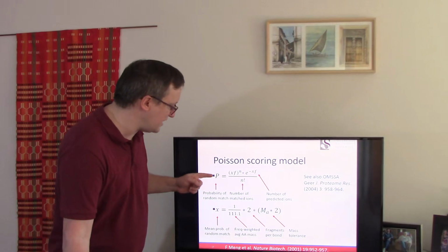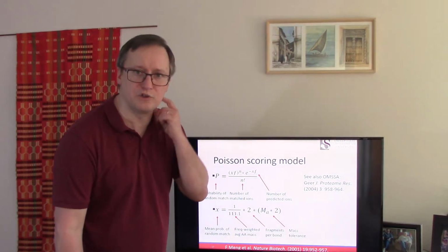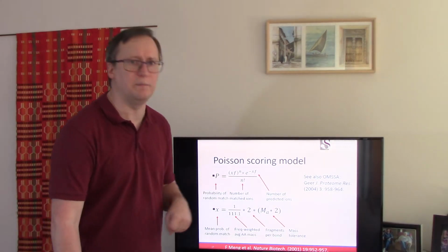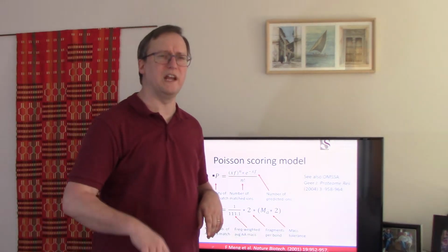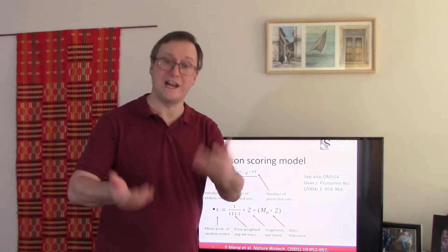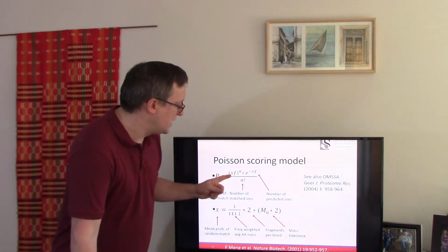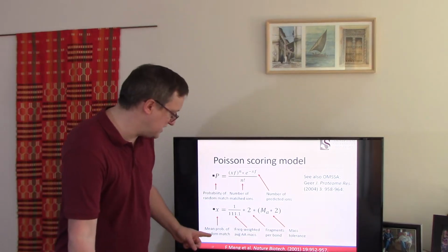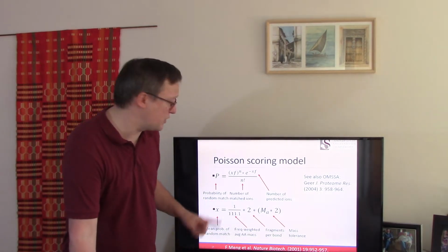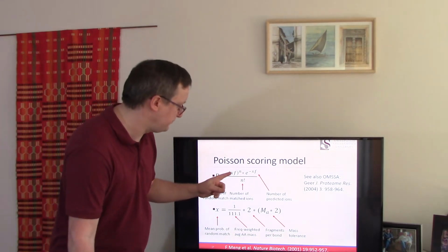Okay? So we have X, F, N, E, X, F, and N here, all showing up at the top. I've tried to add definitions of each of these. So E, I hope people remember, is a value of like 2.718, I think. It is the base that we use for natural logarithms. So that's just 2.7. Substitute that in. All right. Now, we have X, which is the mean probability of random match. It's going to get defined in its own equation. So hold X aside for just a moment. We're going to come back to that.